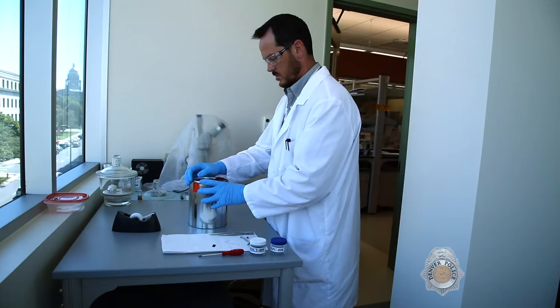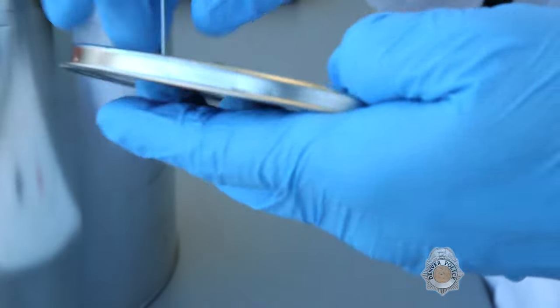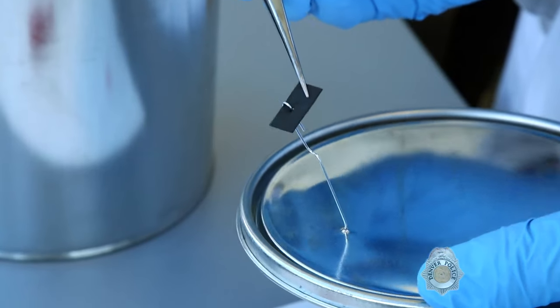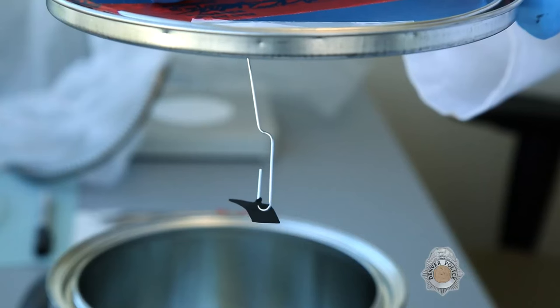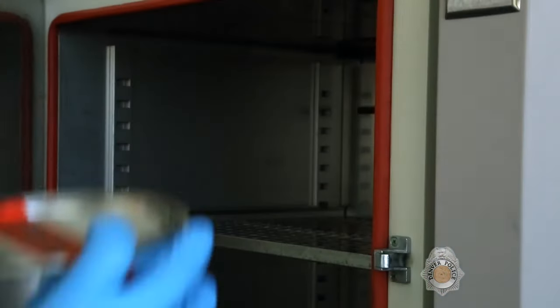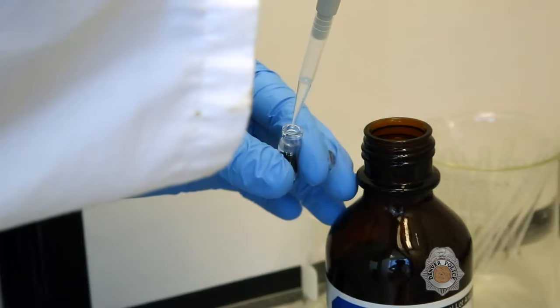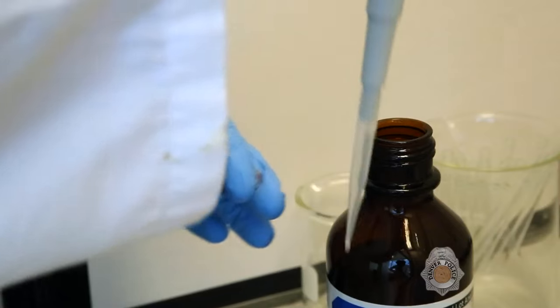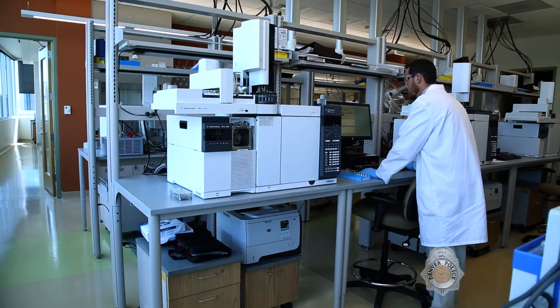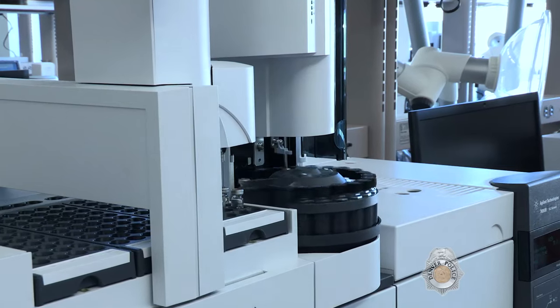In addition to narcotics testing, the Forensic Chemistry Unit also analyzes for ignitable liquid in arson debris cases. The sample being prepared here will be heated in an oven along with a carbon tab. The small tab, which is placed on the lid of the testing container, will absorb any volatile compounds that are driven off the material inside. Those compounds are then extracted from the carbon tab using a solvent. They can be analyzed using an instrument called a gas chromatograph mass spectrometer, which is also used in controlled substance analysis.